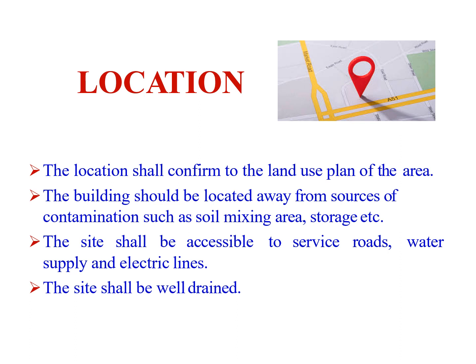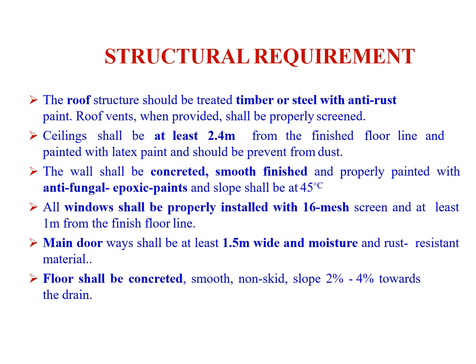And also the service road should be connected for loading and unloading the materials we are preparing or going to purchase. And the site shall be well drained. The structural requirements are very essential, because this is a one time investment. We can't reconstruct the structural plan.